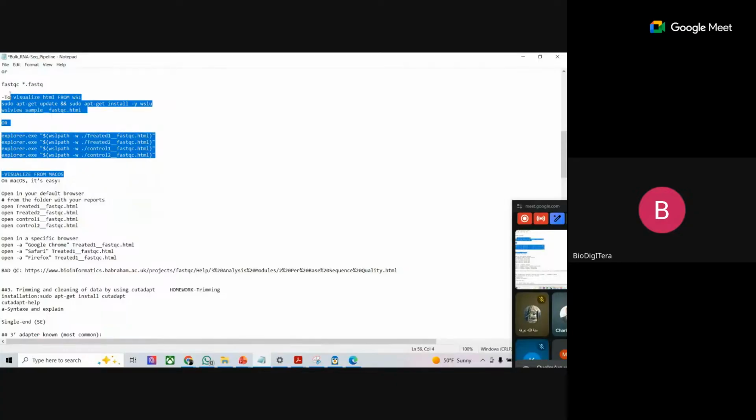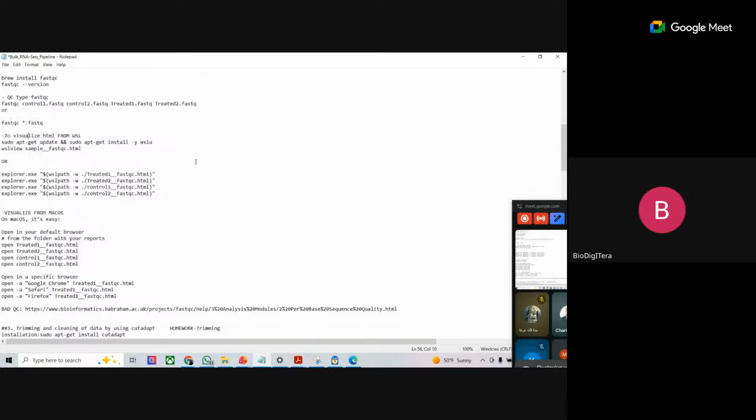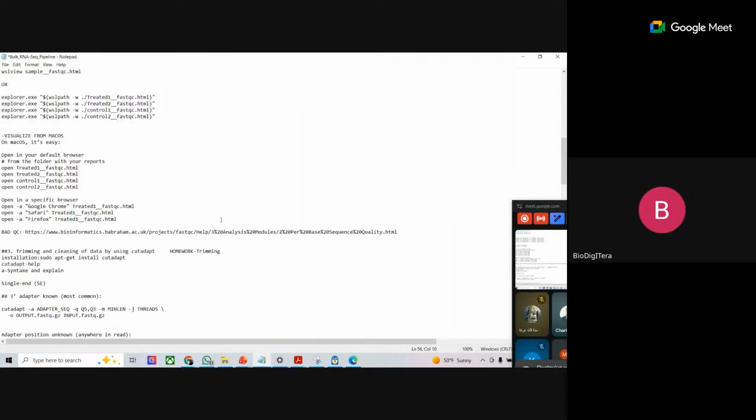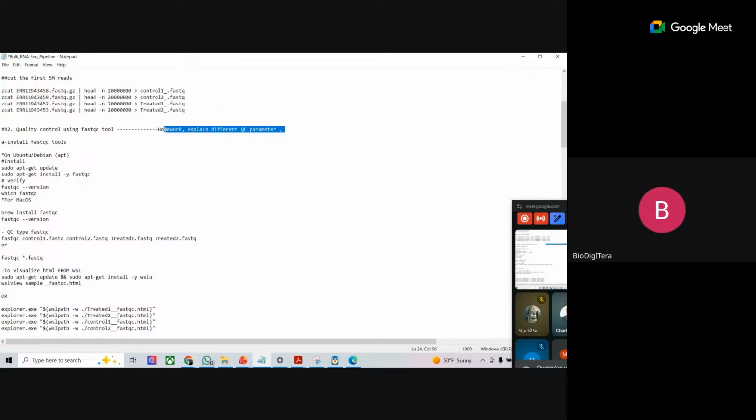So right now, I consider that we have finished the second part, that is FastQC. And I did not discuss all the parameters, so I will give you as homework to find the information about the 8 other parameters.